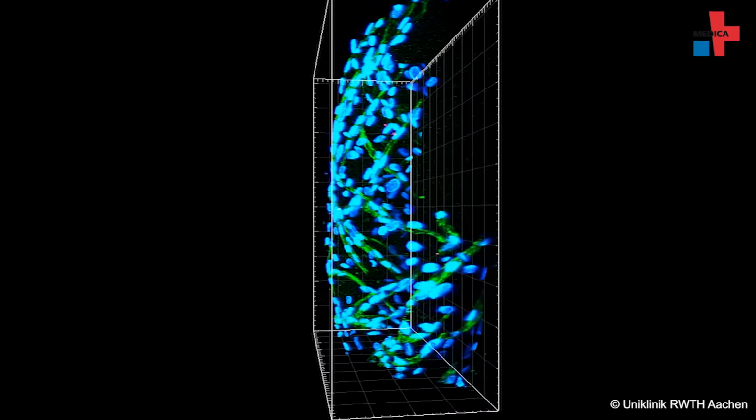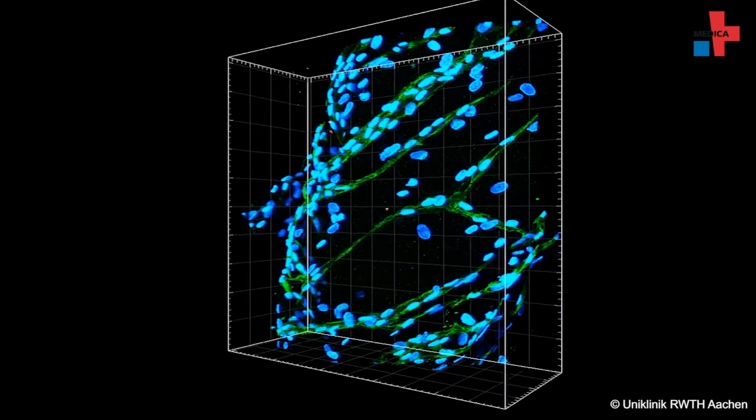And we can modulate these fibrin-based hydrogels in a way that we can direct the cell behavior. And the partners from the Fraunhofer ILT produce 3D printed structures where we can add the cell-laden hydrogels, and they also developed a bioreactor, or better, a mechanoreactor, together with their cooperation partner, Professor Mehler in Munich.